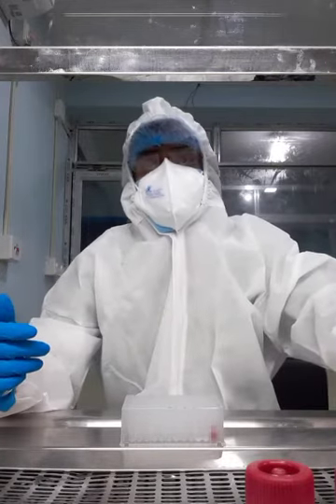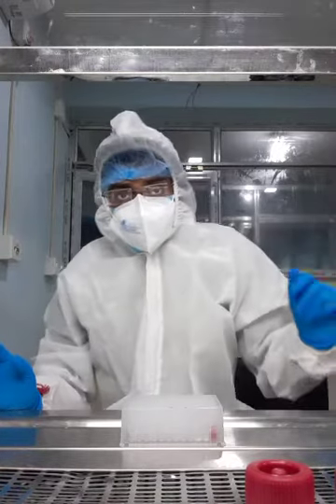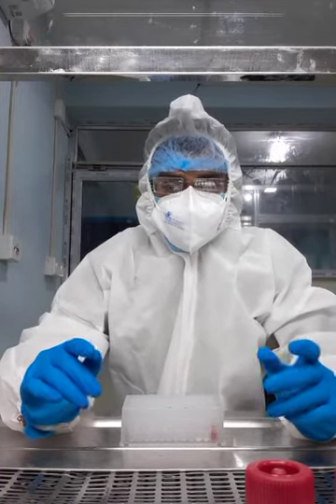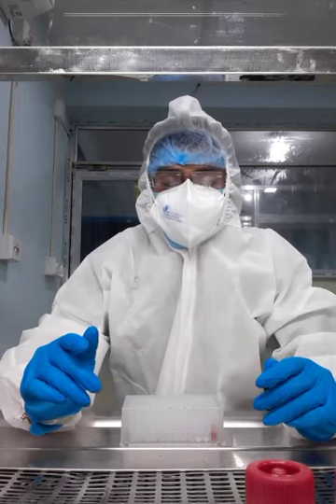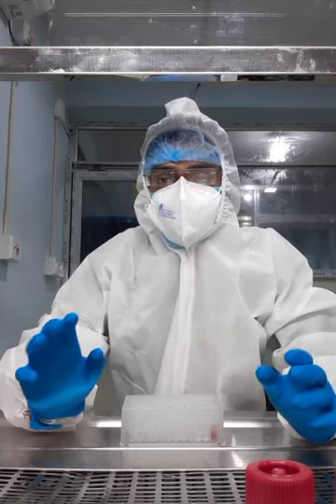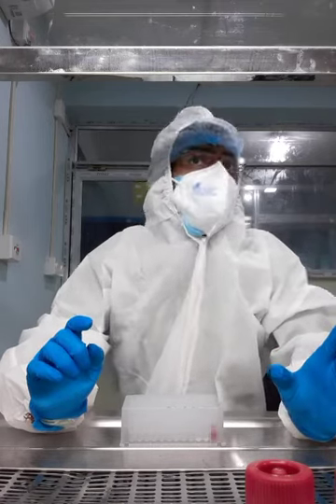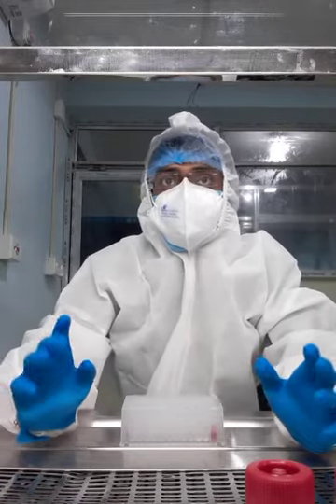Initially, when you put the T-lysis buffer, you can use a single tip. I told you before that when you put the T-lysis buffer, you can use one tip for putting all the samples because there is no contamination of VTM sample there. But after putting the VTM sample, don't use the tip a second time, it can be contaminated. So be careful.